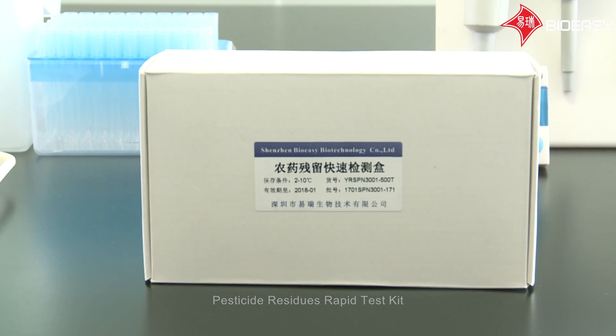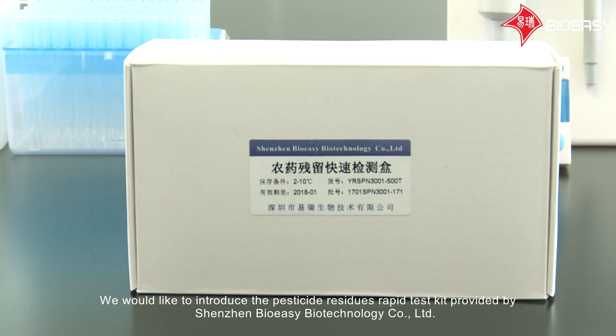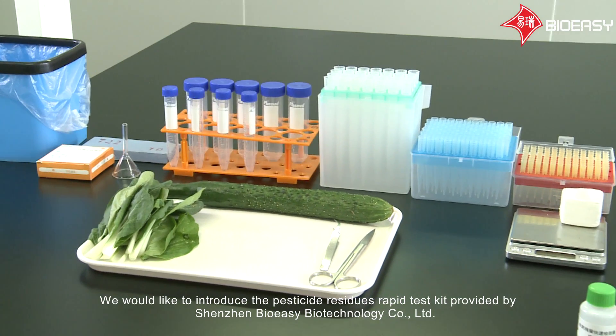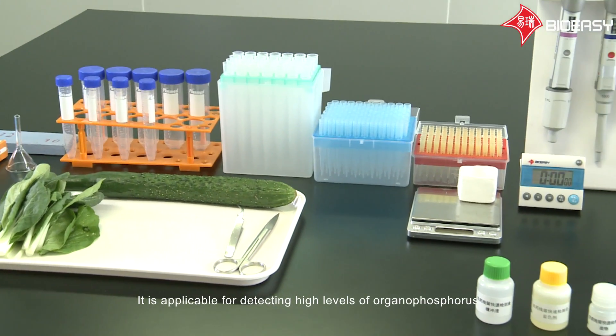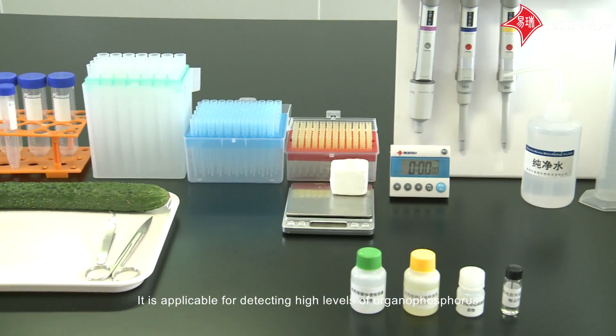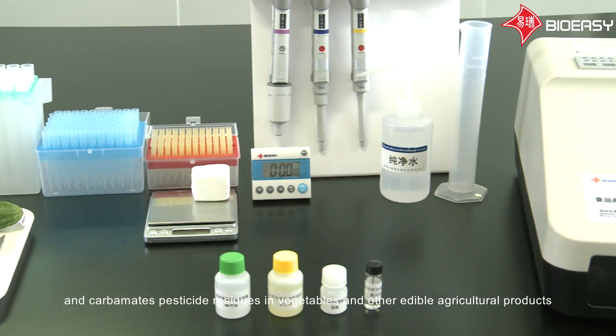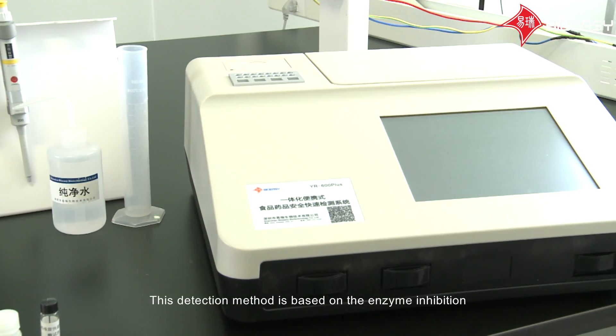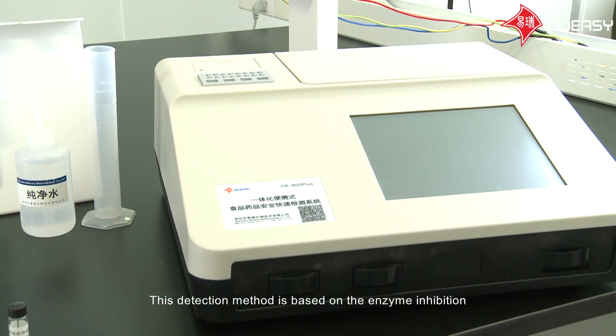We would like to introduce the Pesticide Residues Rapid Test Kit provided by Shenzhen BioEasy Biotechnology Company Limited. It is applicable for detecting high levels of organophosphorus and carbamate pesticide residues in vegetables and other edible agricultural products. This detection method is based on enzyme inhibition.